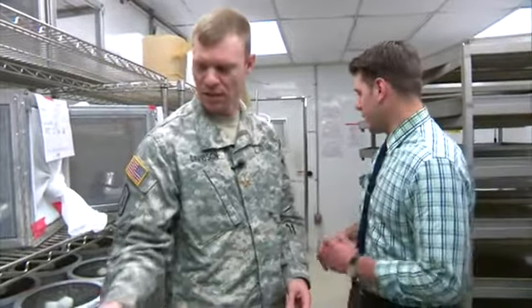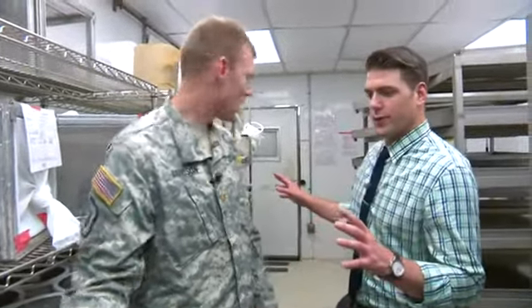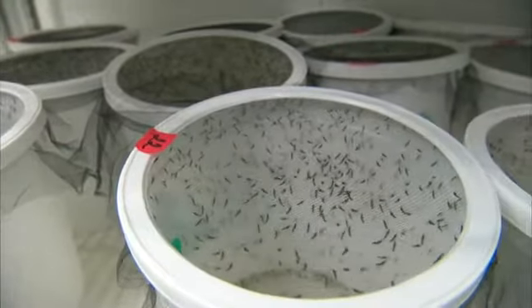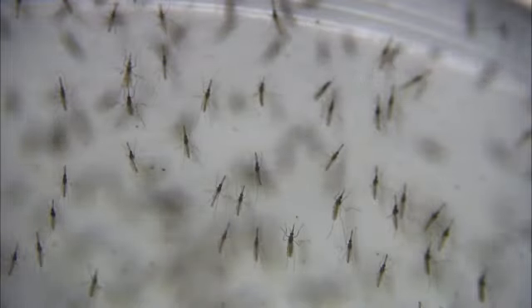So at any given time, about how many mosquitoes are in this room right now? We produce anywhere from 10,000 to 20,000 females a week. Wow. So these lids are on here tight then? Yeah. Okay. Next, we went to the challenge room to see how they test their vaccines.